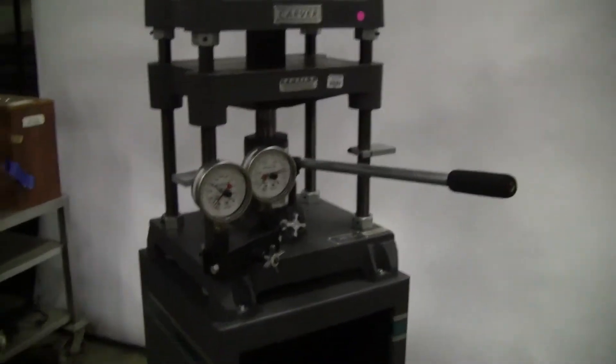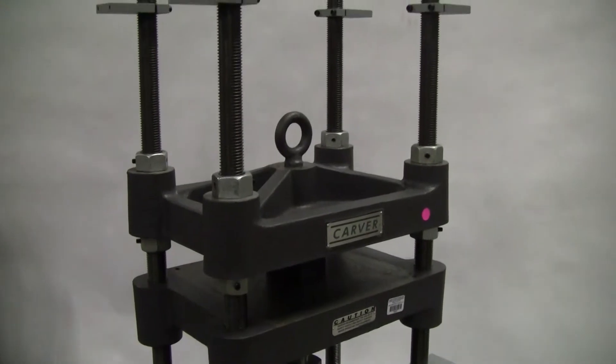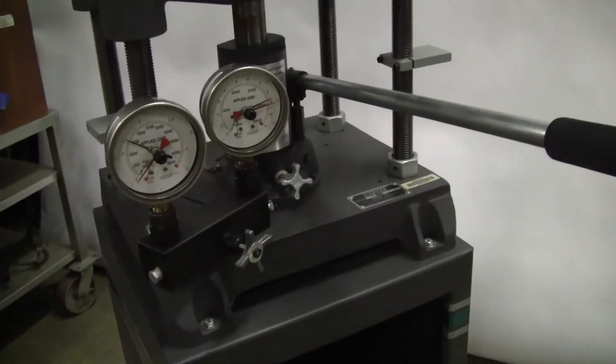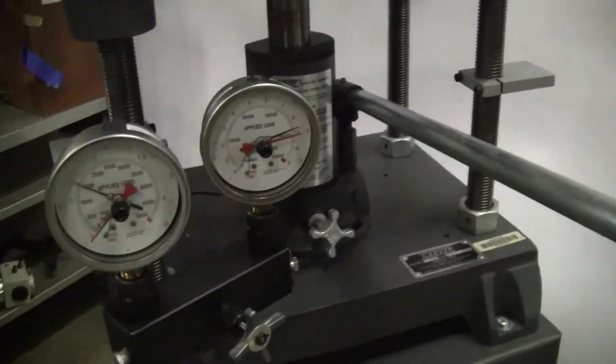Hi, this is Michael Naitow from Hitech Trader. Today we're looking at a four post Carver press. This is a 12 ton press. The model number is 3969. It comes with the stand.